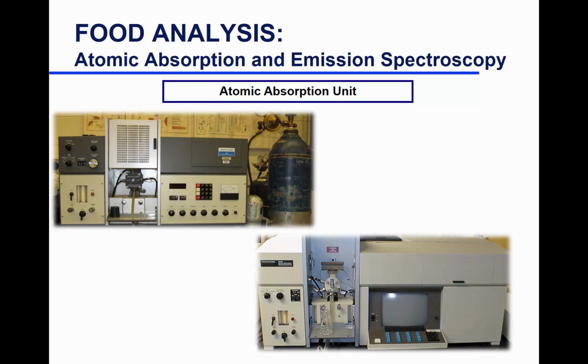This is a newer model, but again, not the one that we have. I should get a picture of that. So you have a small tiny capillary tube that will be placed in your sample, and that tube will aspirate your sample into the nebulizer. So it goes in there, and the sample nebulizer would convert a small portion of the liquid. Most of the liquid is going to go into this large tube here going to the waste.